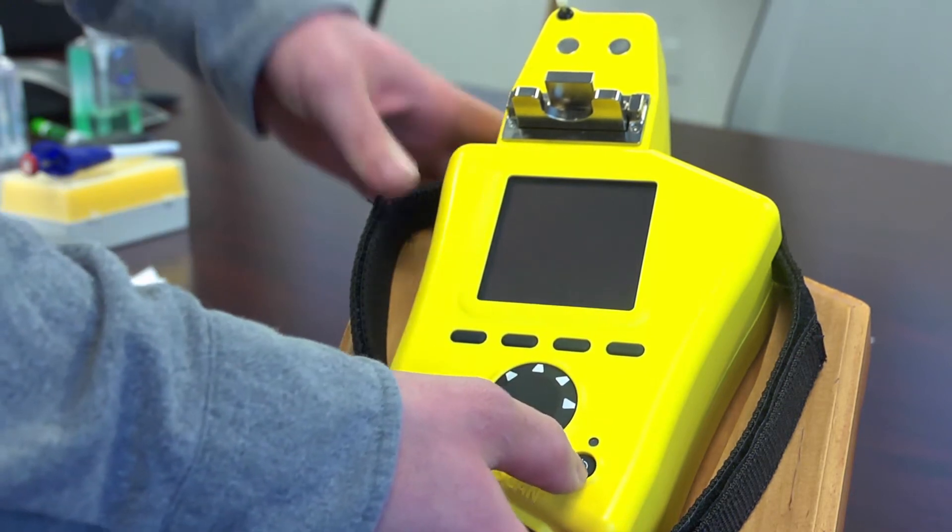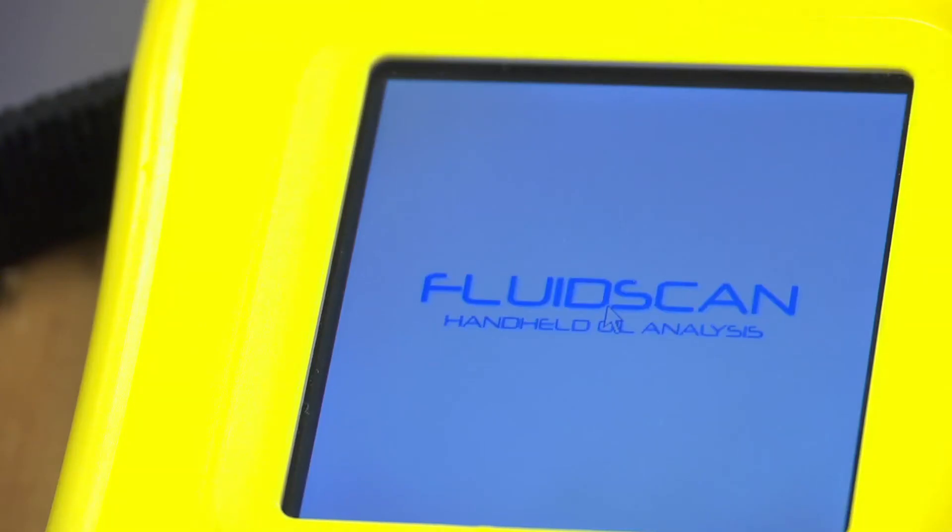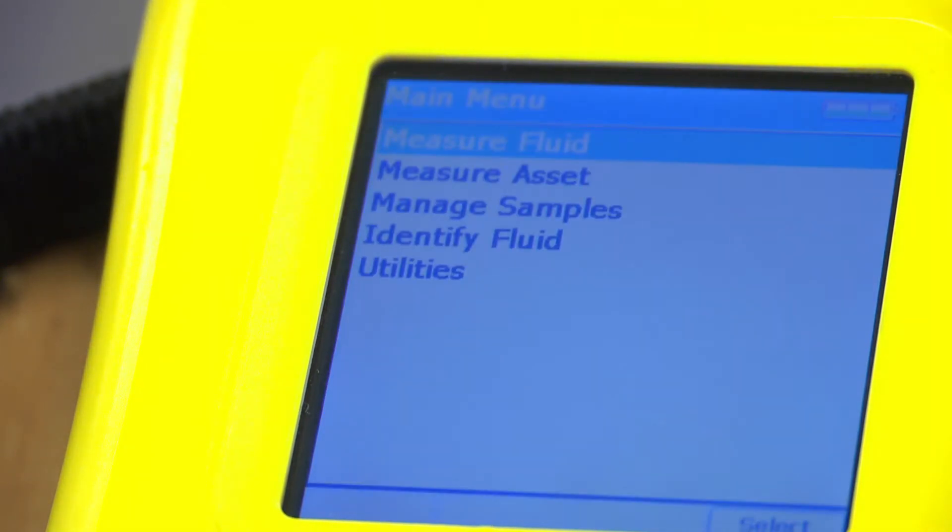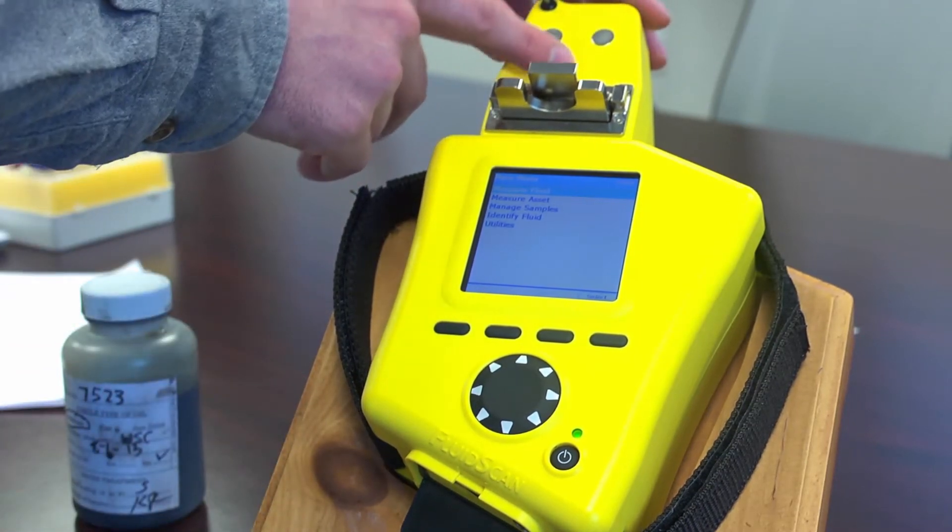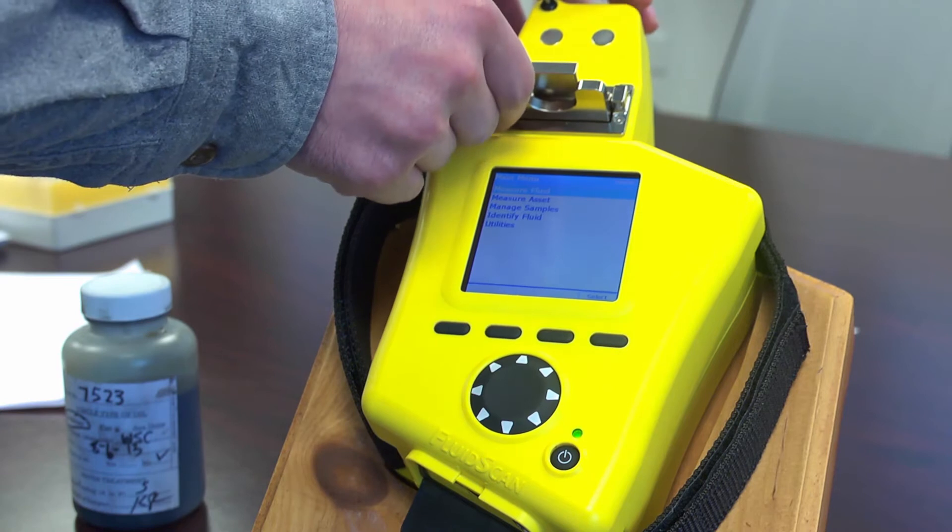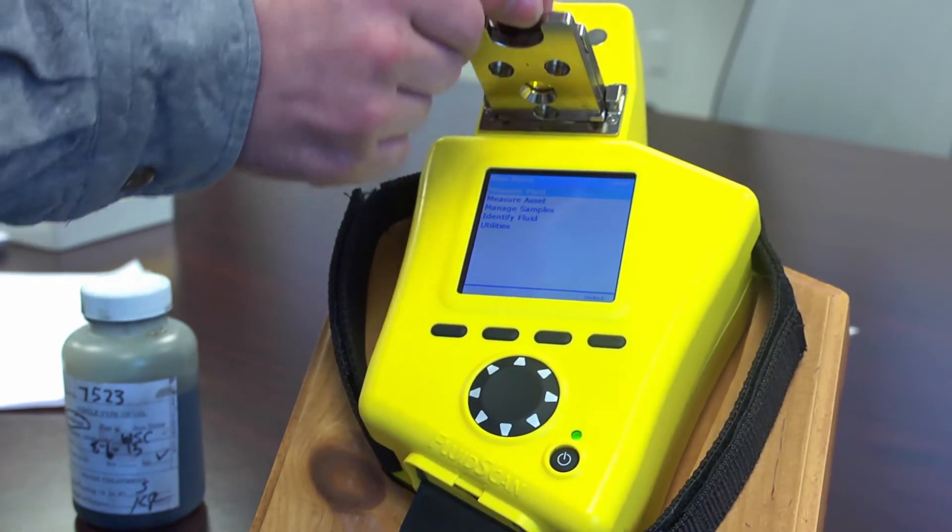To simply state, you can turn the unit on which takes only a couple seconds. From the beginning you have the source that creates an IR laser that is pushed through the flip top flow cell.